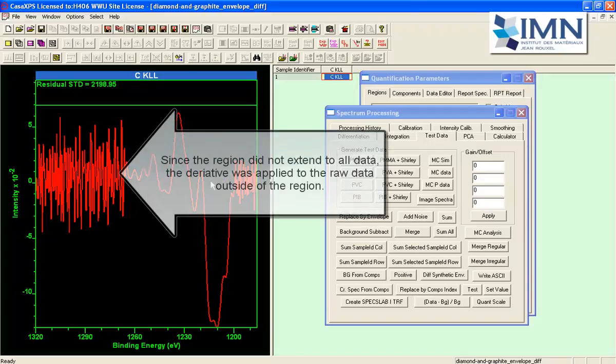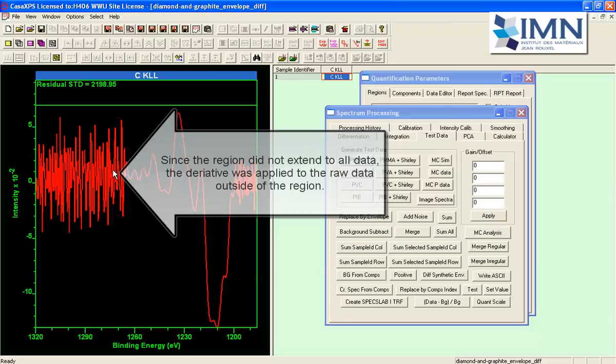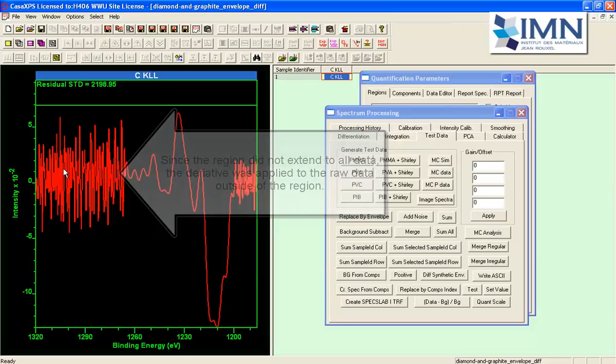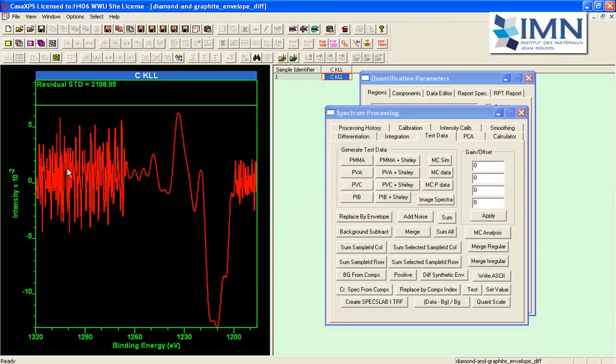These correspond to where no approximation was there therefore you have got the differentiation of the raw data hence you see the noise.